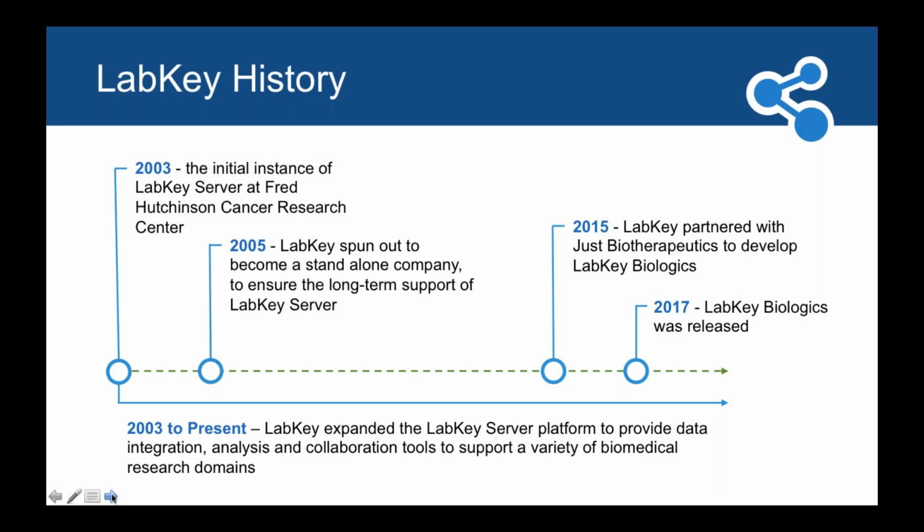LabKey has been around for 14 years. The initial instance of LabKey Server was deployed at Fred Hutchinson Cancer Research Center here in Seattle, Washington in 2003. And the company was spun out as a standalone company in 2005. So even though LabKey Biologics is a fairly new product launched earlier this year, it is built on the foundation of LabKey Server, which has been used by hundreds of clients around the world for well over a decade. And during that time, we've continued to build a variety of different features, integrations, and reports within LabKey Server that help research groups manage biomedical research data.